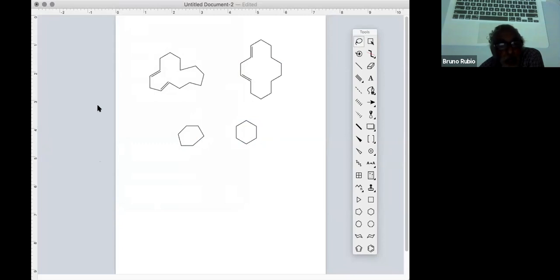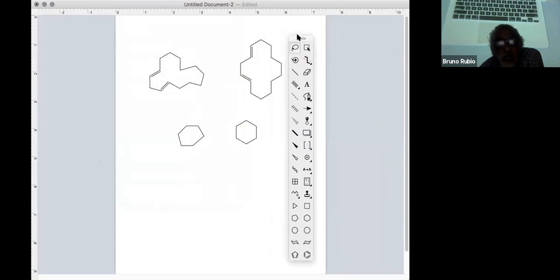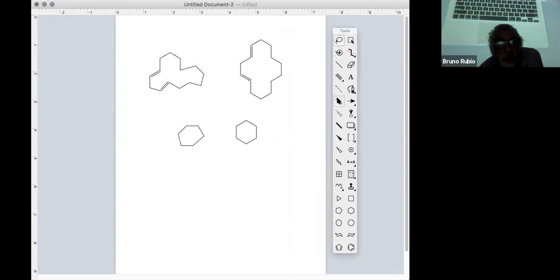All right, so lots of times... I can't see the toolbar. You can't see this? Right, you have a toolbar up here and you have another toolbar here. So can you see the toolbar now?